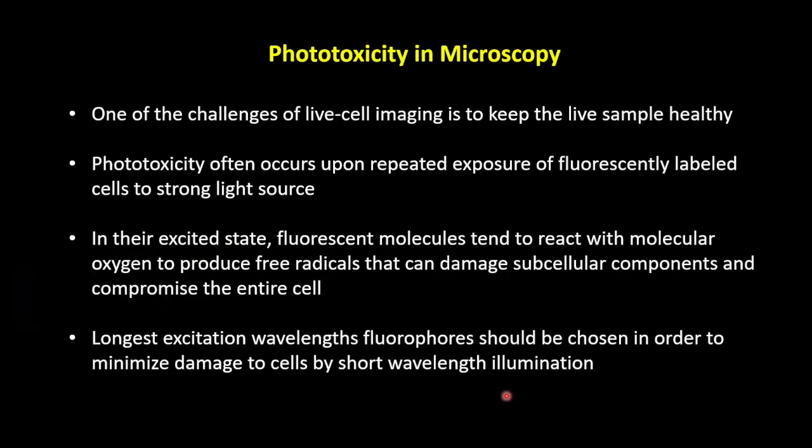Another very important term in life sciences is phototoxicity in microscopy. The challenge for live imaging is phototoxicity, because it can happen when you shine a very intense laser on the sample, and the cell will release free radicals, which can damage the cells very quickly and also stop some physiological conditions.